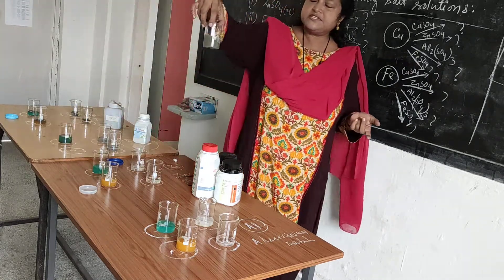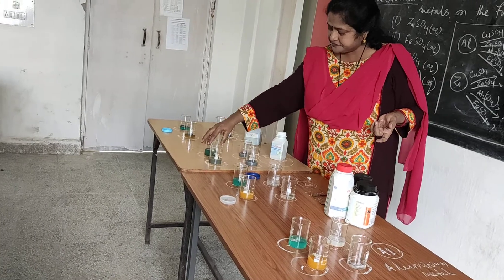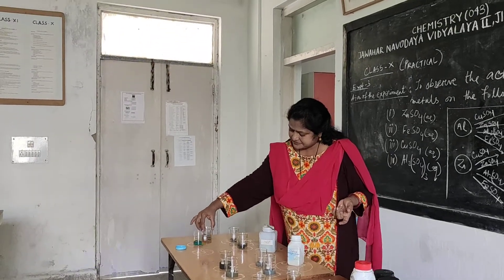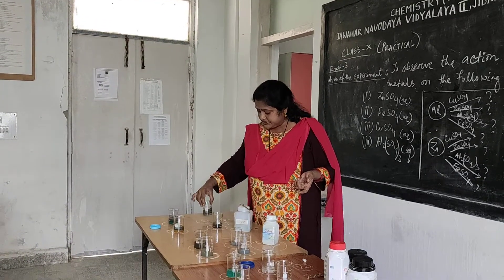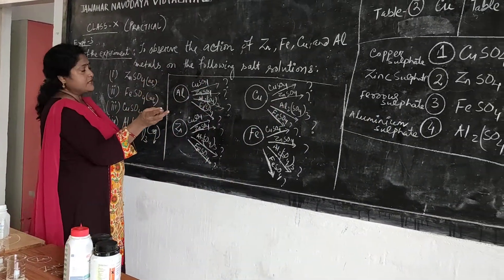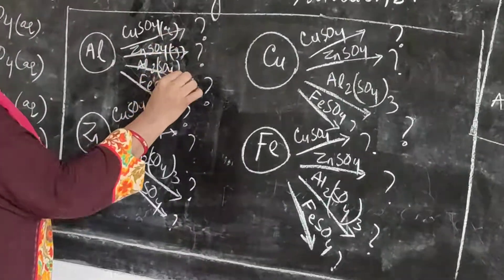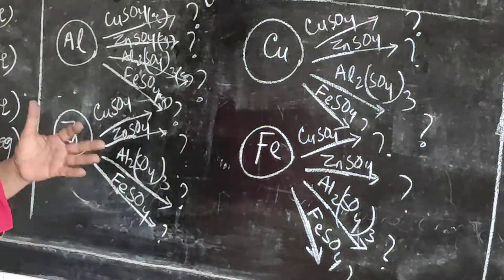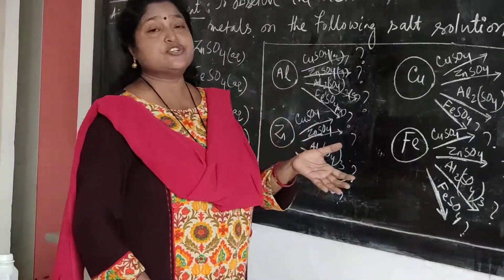Here you are seeing a magnificent reaction is occurring — you see, it has started reacting students. I am just stirring it so that we will get a better result. Now we will come to the observation table. We will take every metal and react them with aqueous copper sulfate, aqueous zinc sulfate, aqueous aluminium sulfate, aqueous ferrous sulfate. I have put question marks here — you can write which metal is reactive and which metal will change and replace the other metal in solution.